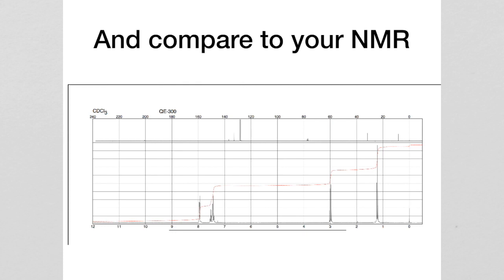and you'll get this NMR from me. There are 2 videos on Canvas, show me videos, that show you how to interpret these NMRs in detail. This is your C13, this is your proton NMR. Okay? Now, what we need to use this NMR for right now is to get some ideas about some things. We need to decide what's going on with this unsaturation. Do I have an alkene or an aromatic? Also, since I have a carbonyl, do I have any indication of whether I have an aldehyde, a ketone, or an ester? And that's all I'm going to use this NMR for right now.